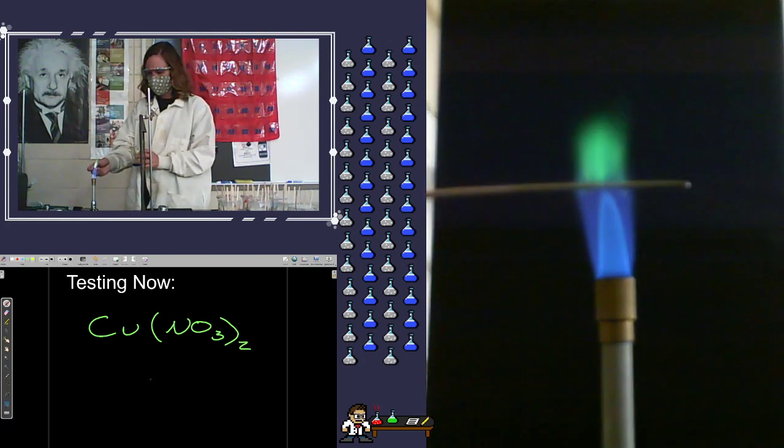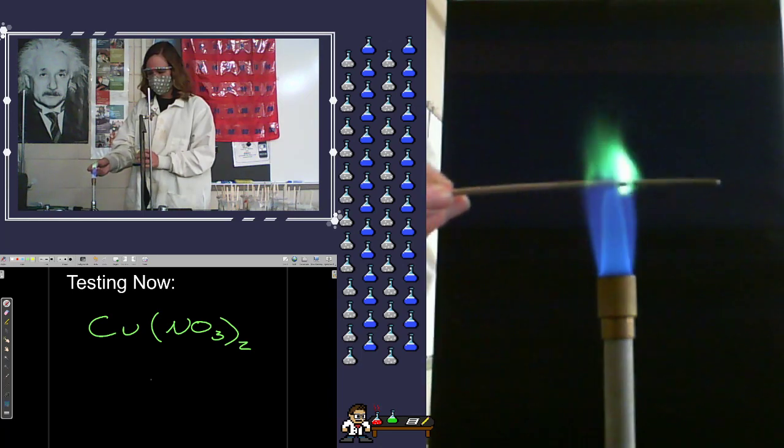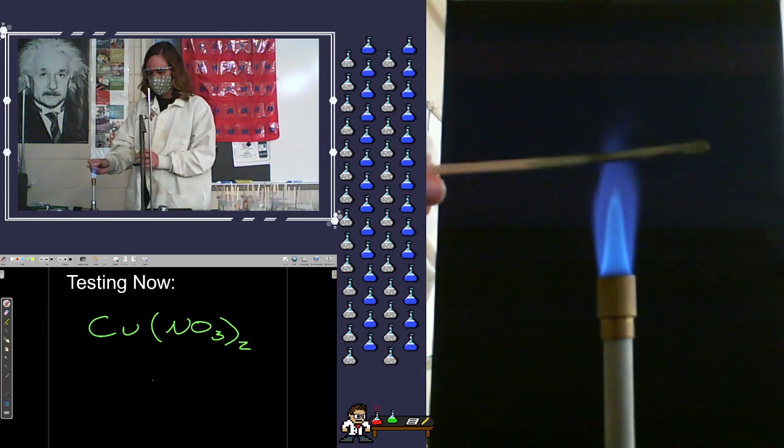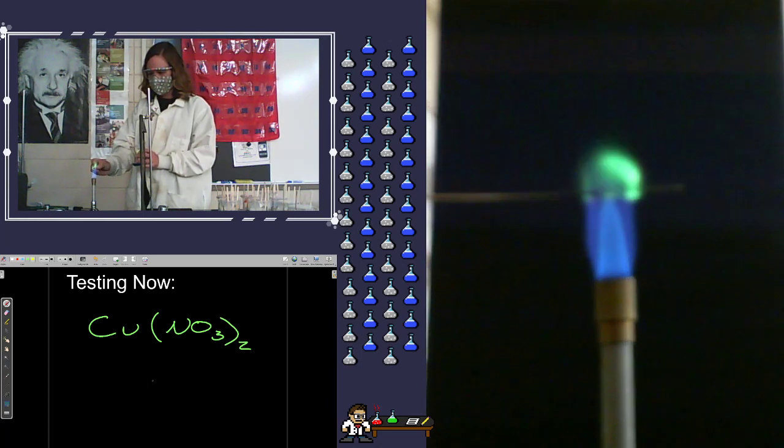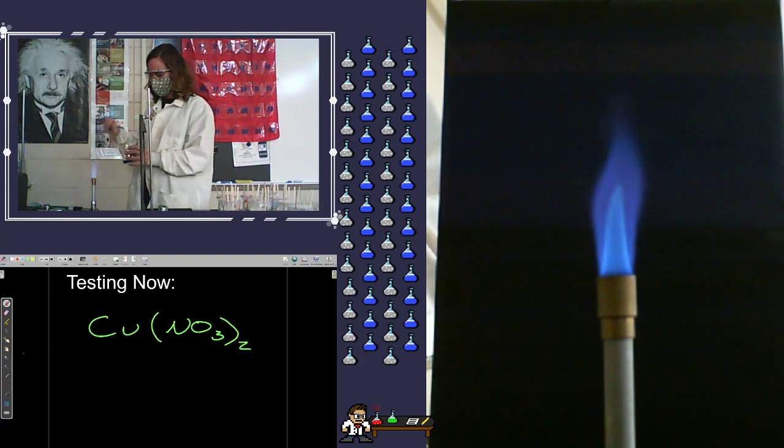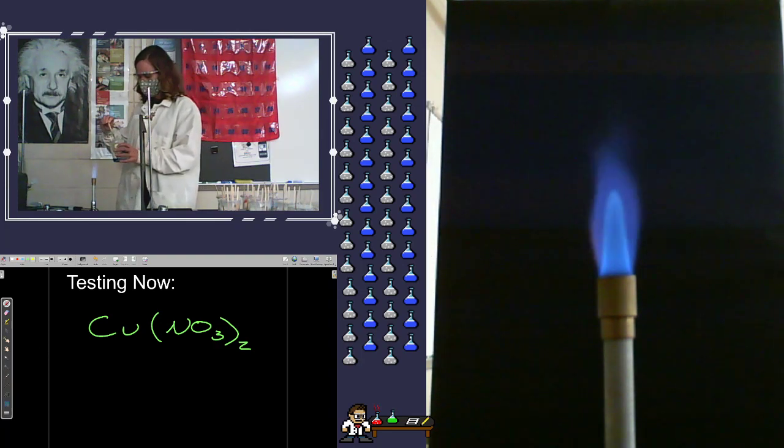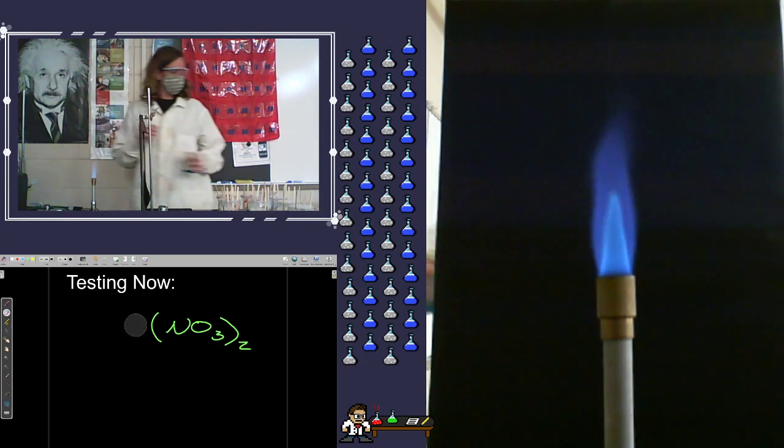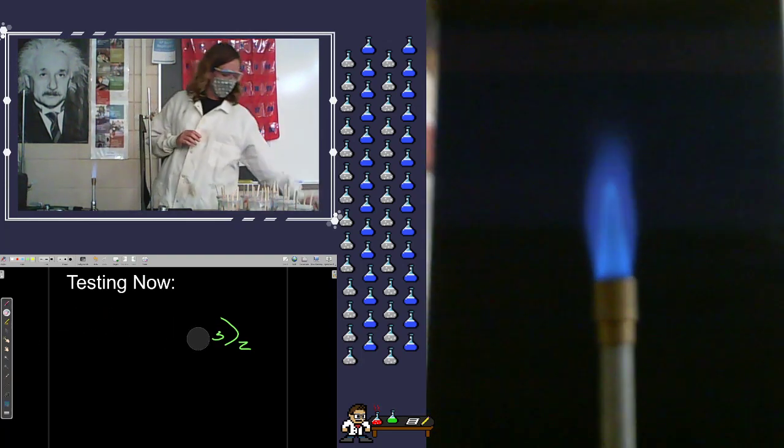Oh, that's my favorite. I love that one. Reminds me of Wizard of Oz, Emerald City. I wonder if that's what they did. I feel like it's a distinct possibility.